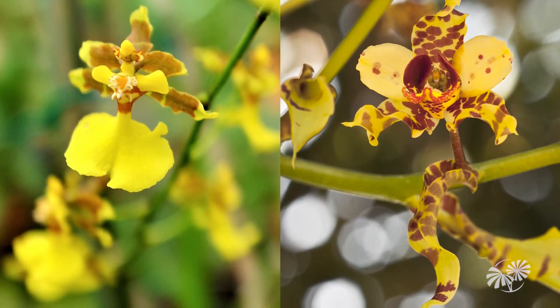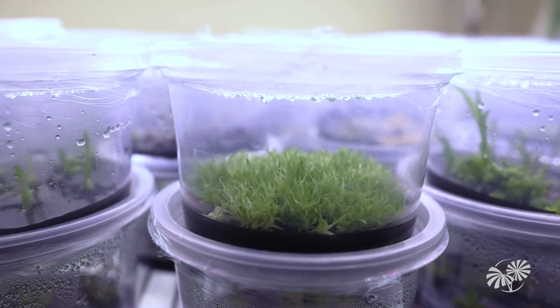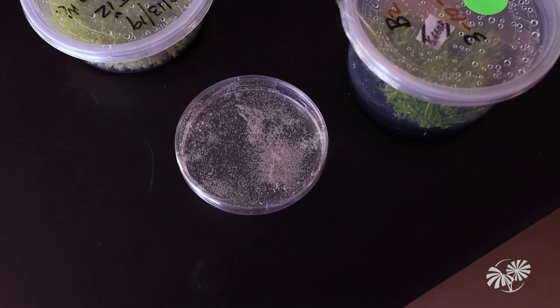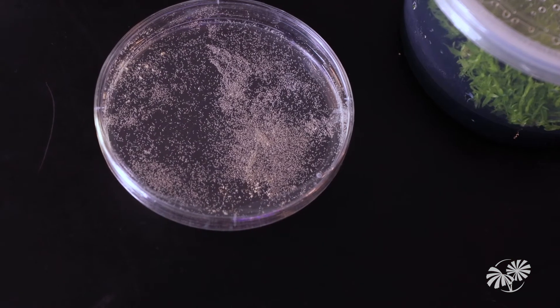In the wild, germination is very difficult for these tiny seeds — they have to have just the right conditions. But if we provide them the nutrients directly in the laboratory, we can germinate nearly a hundred percent of the orchid seeds. You're seeing tens of thousands of seedlings in just this one container.